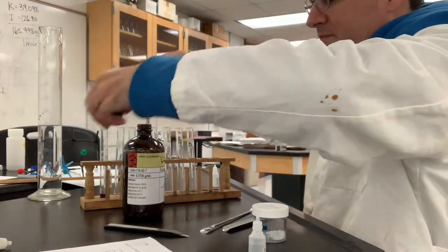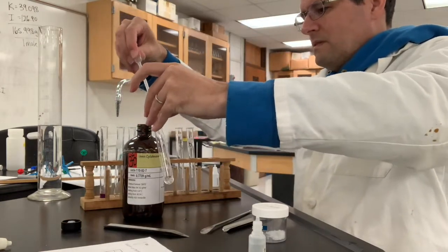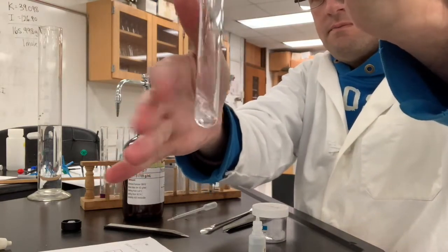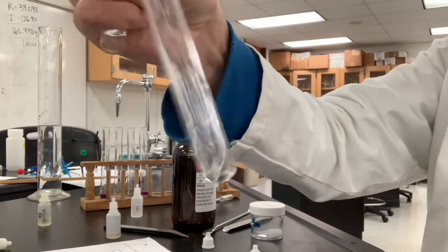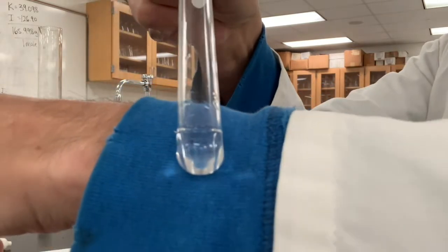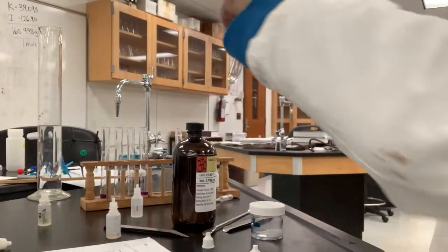Cyclohexane is next. In my hand, as you can see in this frame of the video, is the sugar with water. Sugar is white, so I'm holding it up to this blue background — do you see any crystals of sugar left in there? Is it soluble?